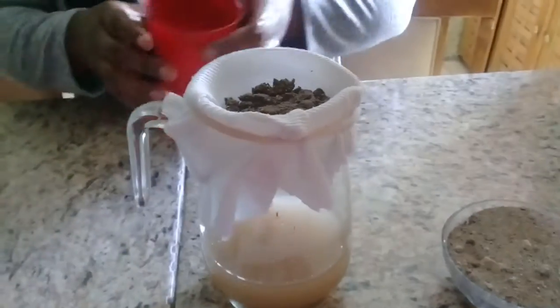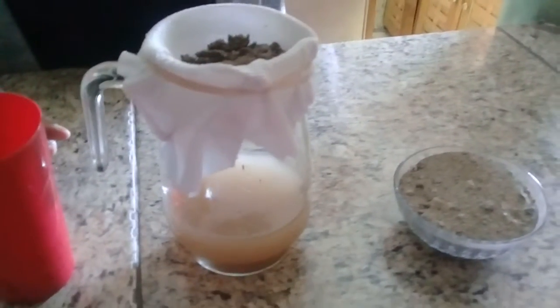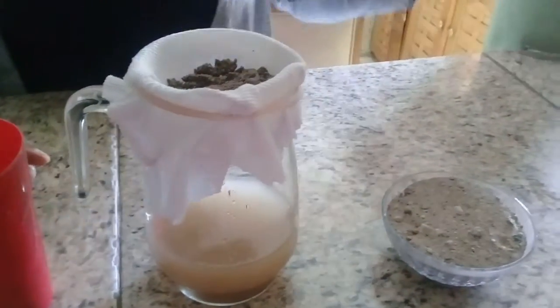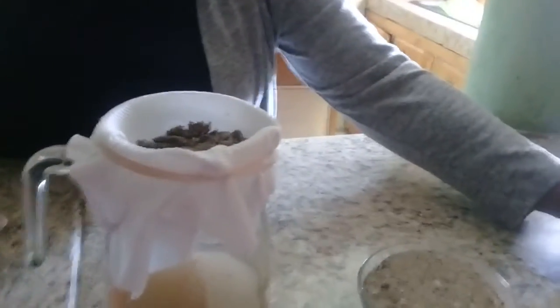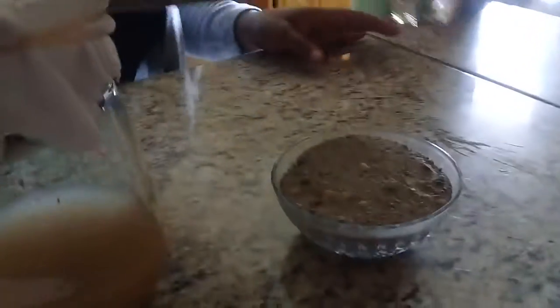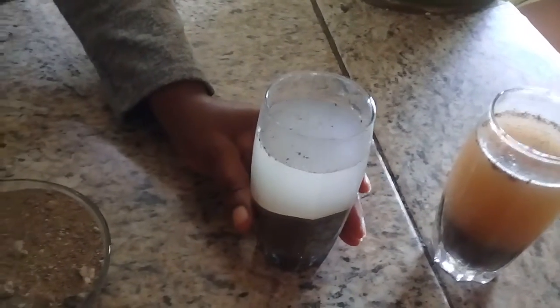Now remember I said to you earlier that with decanting, both the liquid and the solid are mixed together and left unmolested. In the interest of time, I will show you what the end product looks like. If you compare both of them, you will realize that the liquid in this container is much lighter than this one. It all has to do with the fact that this one was left unmolested for a while. So nobody touched it or anything.